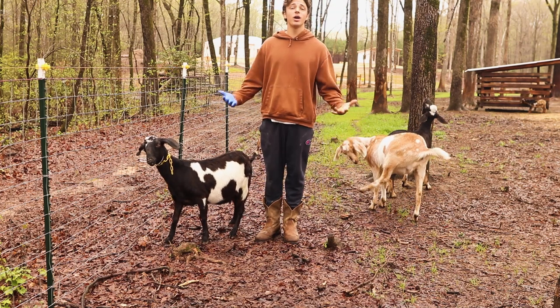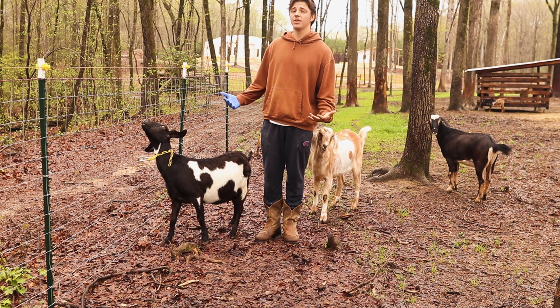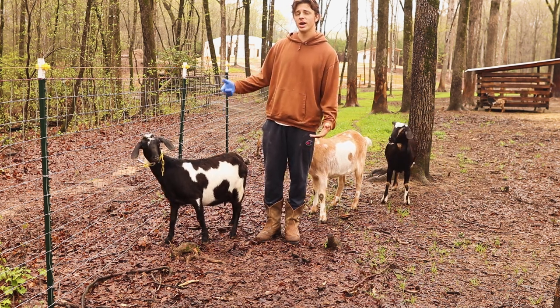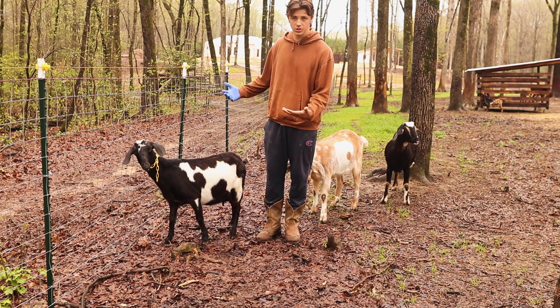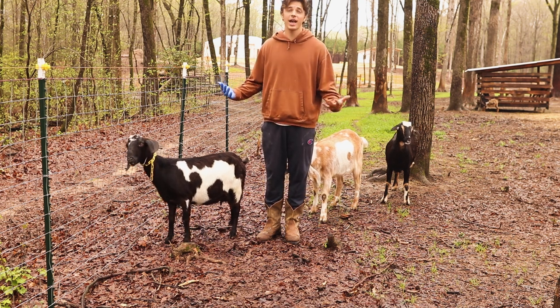Today we're going to be talking about how to run a fecal. This girl right here is Wanda, and we suspect her of having a higher parasite count than some of the other goats. She has a rougher looking coat, it's not quite as shiny, and she's not holding weight as well as some of the other goats that are her age. Plus she just had babies, and typically you'll see a goat's parasite count spike as soon as they have babies.